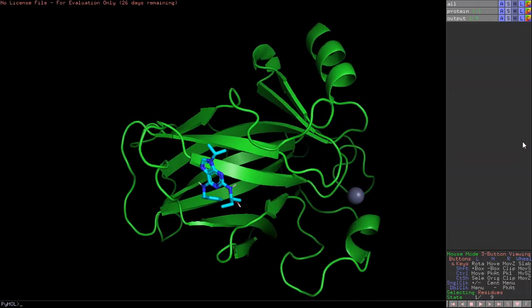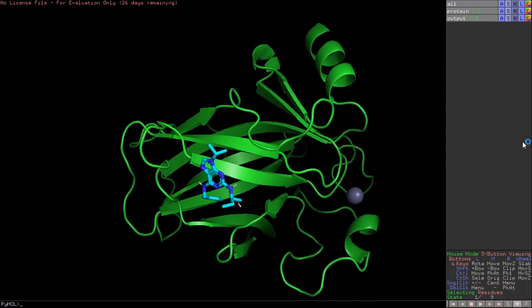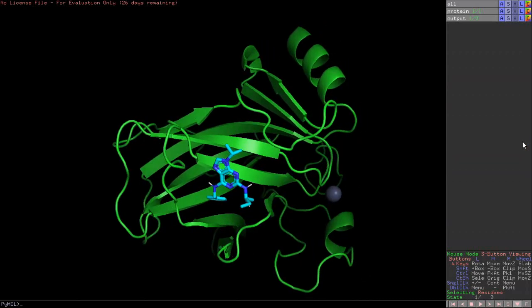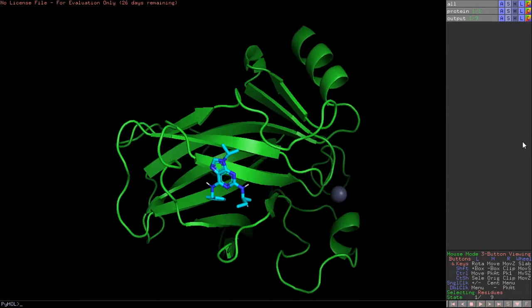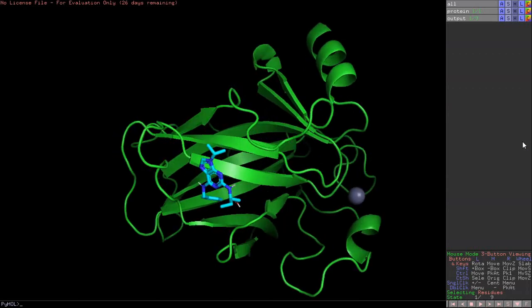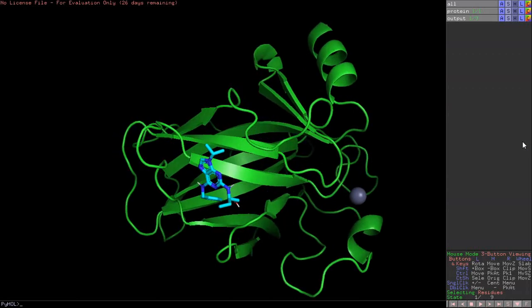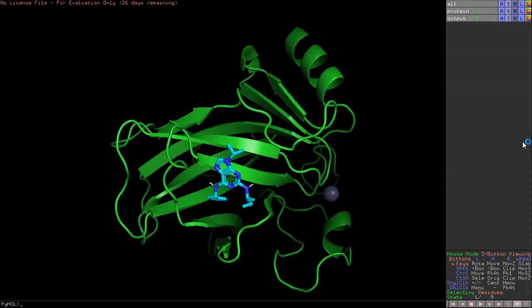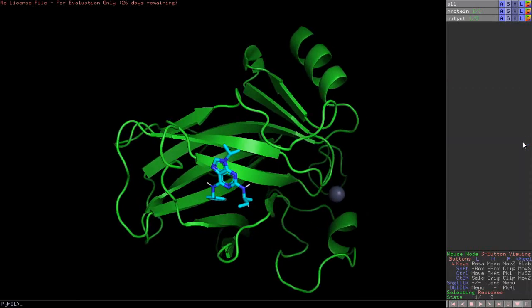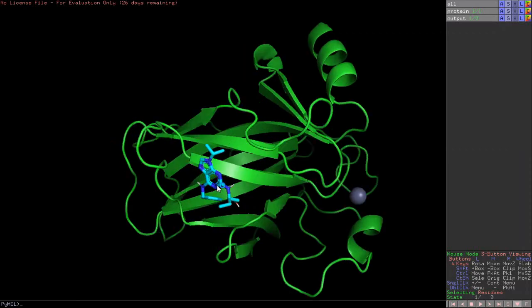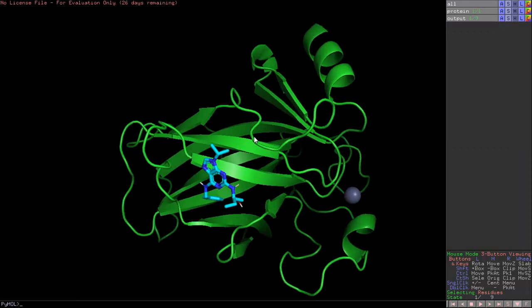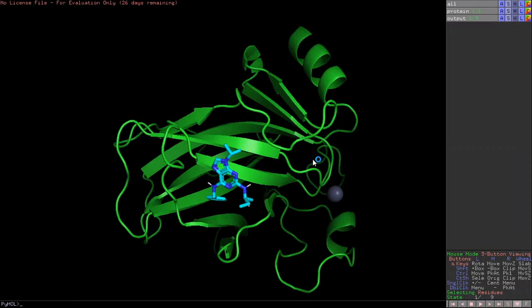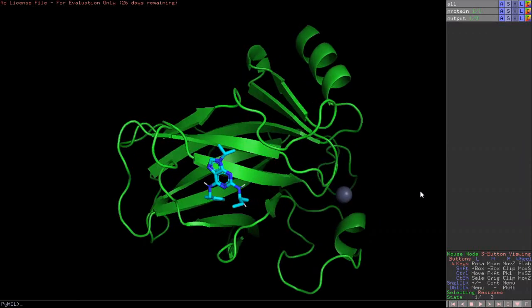I've given you an in-depth tutorial of how to perform molecular docking using AutoDock Vina. In this video, we are going to see after we have done the docking, how to actually look at your protein and ligand interaction. So this is your ligand here, the best docked ligand, and this is your protein, the target protein.